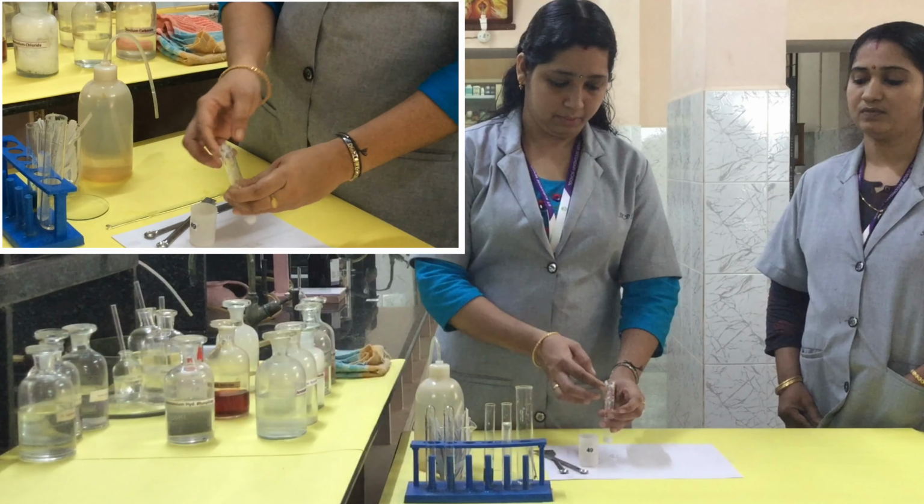Make a saturated solution of the salt for doing the confirmatory test, the ash test.